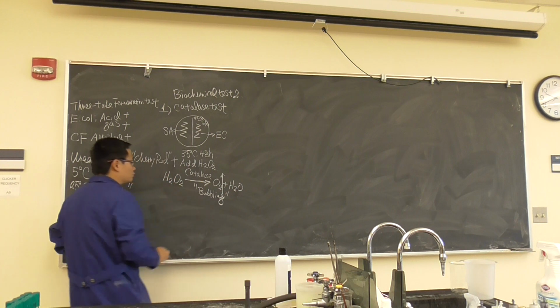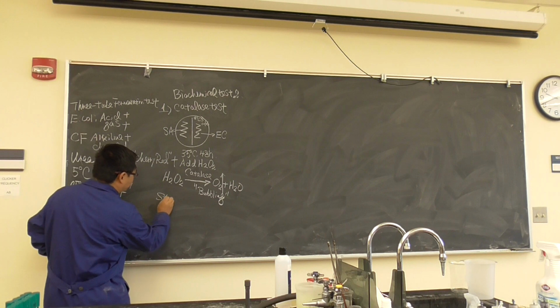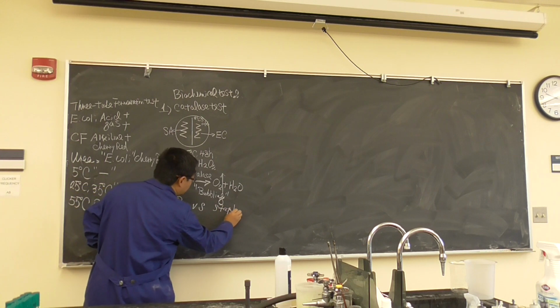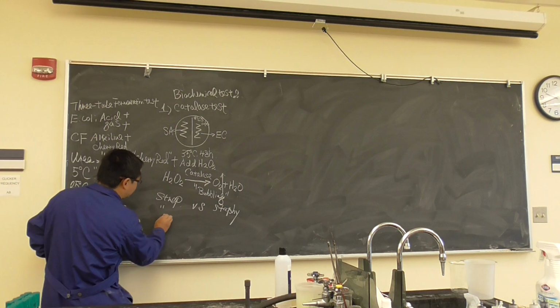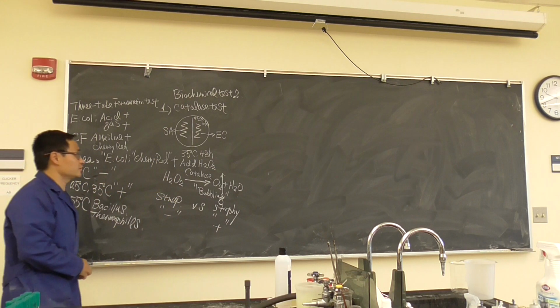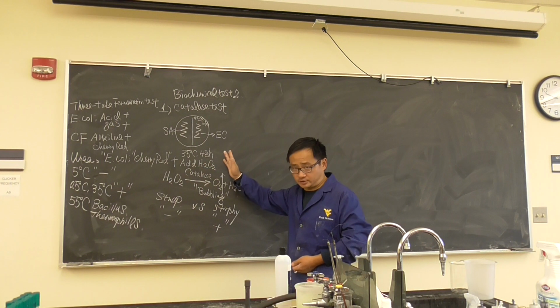And always remember, we talked in the lecture, the catalase test is to differentiate between Streptococcus versus Staphylococcus. It's the easiest quick test. Streptococcus is catalase test negative, Staphylococcus is positive. So that is the first test. You should see one of the sides bubbling, another side not bubbling.